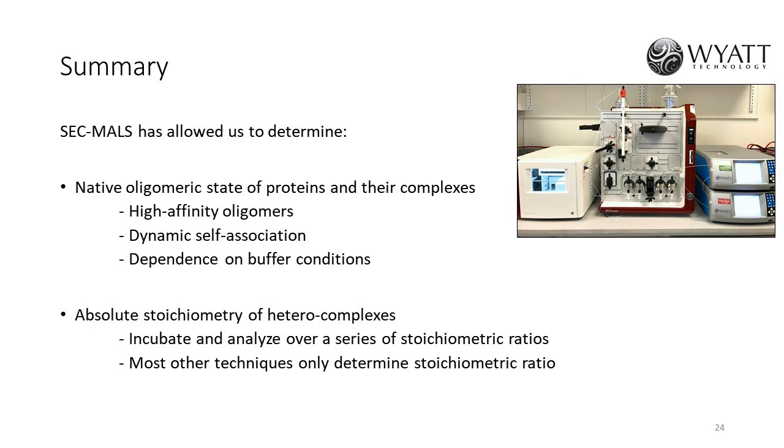Okay, thank you. About the first oligomer shown, why is the MALS graphic showing a continuous line between the molecular weight of the tetramer and dimer instead of two lines at the same elution volume, corresponding to the tetramer and the dimer? Again, it's because the dimeric and tetrameric species are in constant exchange. And one thing is that the SEC-MALS system gives us a weight average of the molecular weights across the peak, so we don't get two separate lines at the same elution volume. We have one line, which is a weight-averaged molecular weight.